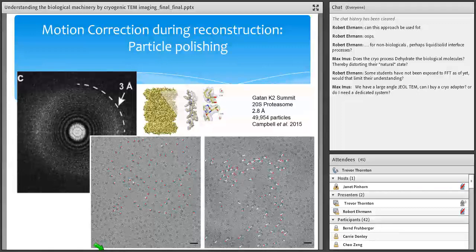Oh, I see. And that's how you acquire that final high-resolution image of what looks like a single molecule, but really it's been captured from all of these reconstructions that you're doing. And so now you understand why this is so computationally intensive. Absolutely.